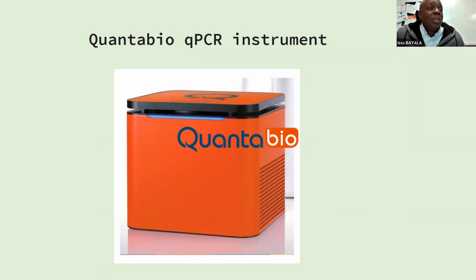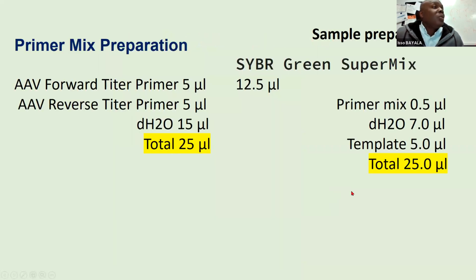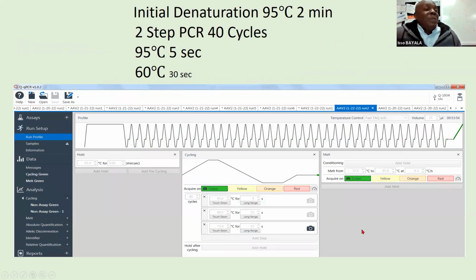So it's actually a good tool for teaching. So we use the QuantaBio. On the next slide, please. So this is the protocol to prepare the primers and the protocol to prepare the samples. So we prepare the samples and the primers.